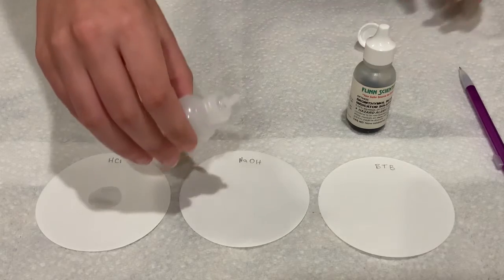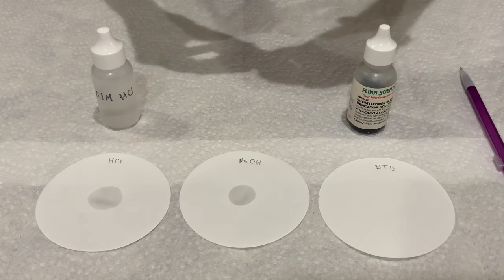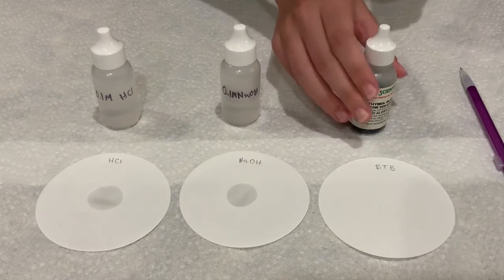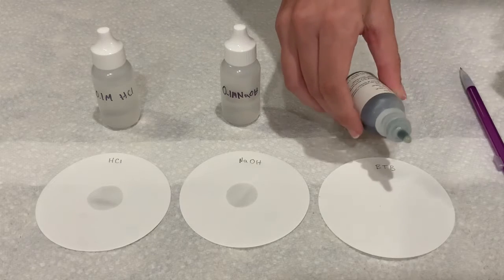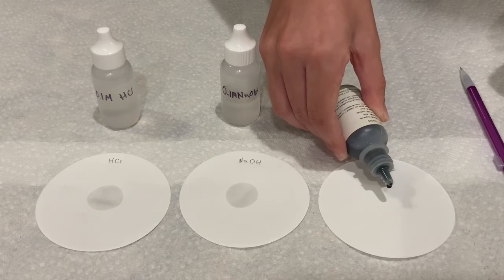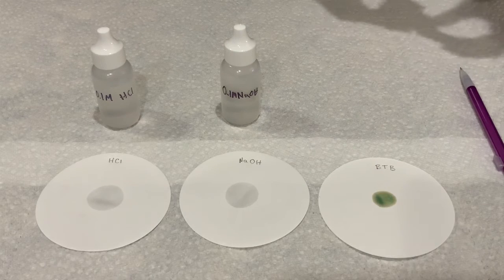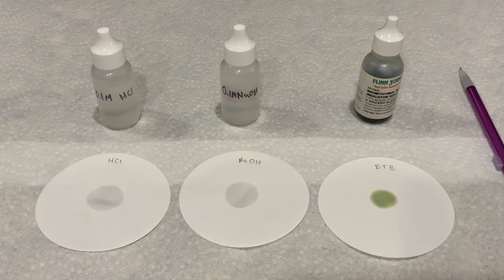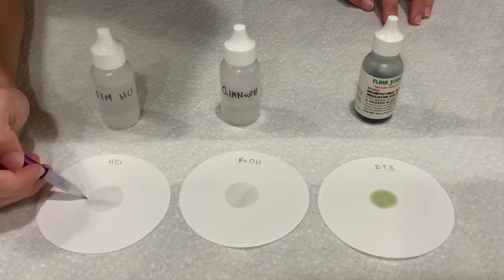So as you can see, when we put the HCl on the surface, it does not change the color at all. It just looks like a wet piece of paper, and so does sodium hydroxide. Now when we put the indicator down just on the filter paper, let's take a look at what it looks like. Dramatic moment. And it has sort of a bluish green look to it. So the first part of our experiment is to put a drop on, then we're going to measure the distance that the water wicked out on each of these pieces of filter paper.